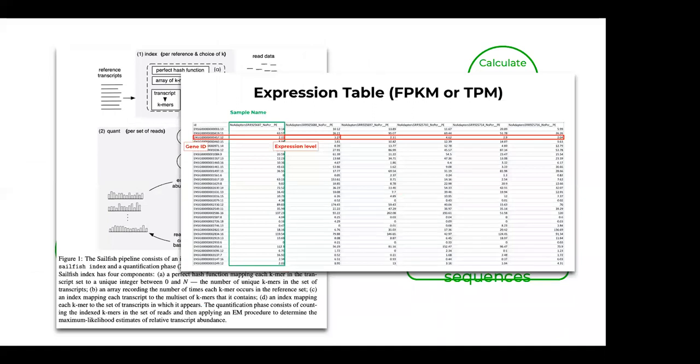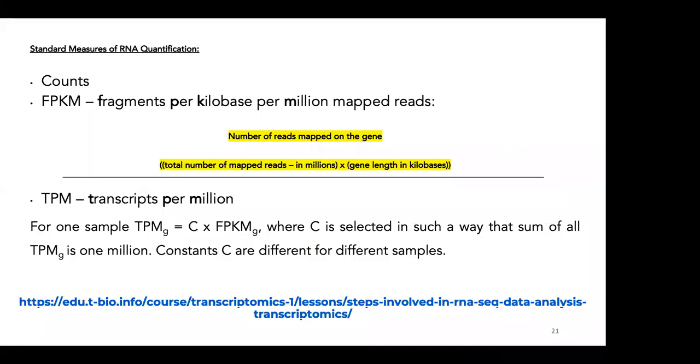So let's talk about the techniques. Expression levels can be quantified using algorithms that align reads. The whole thing that we saw, the alignment to transcript sequences. So HT-seq is another algorithm, and also RSEM, which we discussed. They are used to give this result for an expression table, and it is color coded in red.